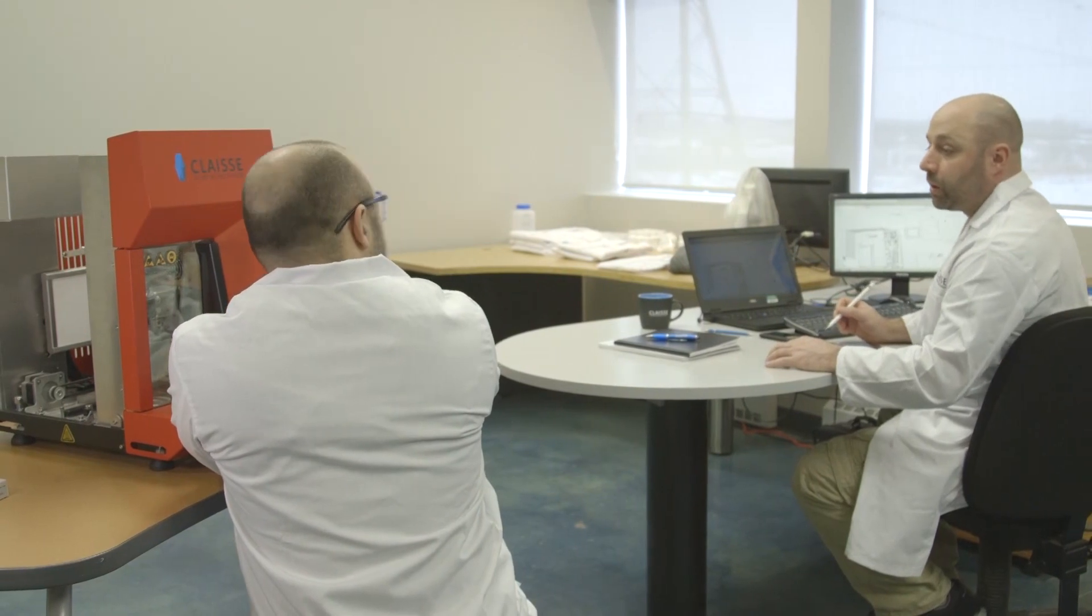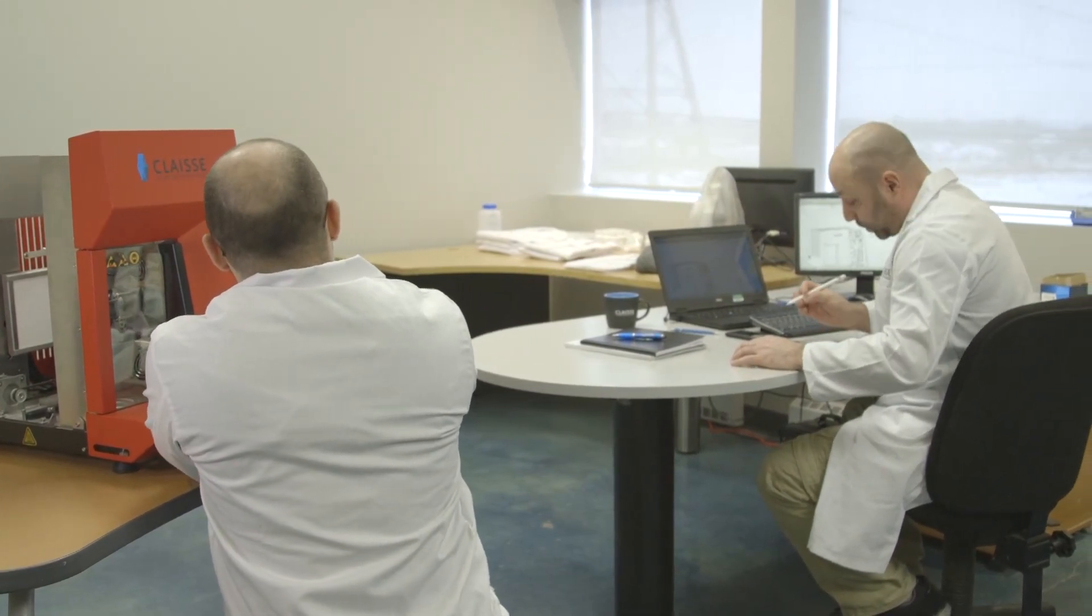We improve users' skills and ensure the obtention of reliable results.